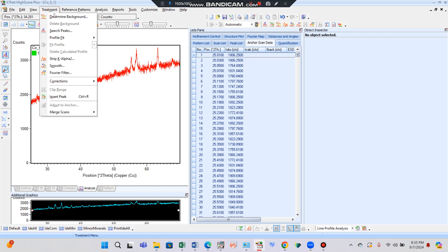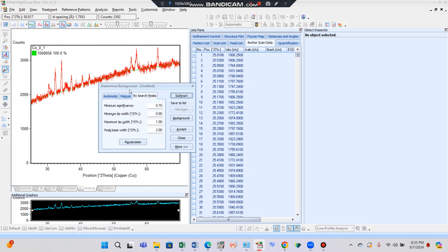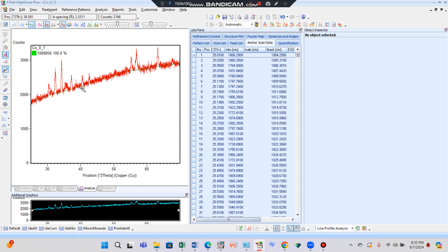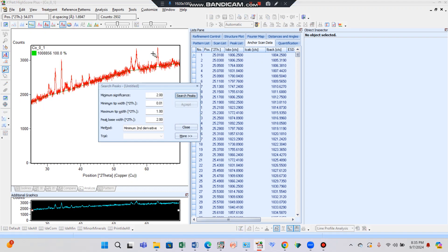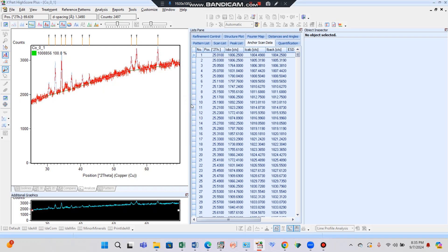Then click Treatment and then click Determine Background. Here we want to accept the background — just click the Accept button. By accepting, you can see a green line is set at the baseline of the graph. Then again click Treatment and then Search Peaks. Search Peaks means you are going to search the peaks. You can see this graph has many peaks, and after searching, all peaks are identified by arrowheads and then accepted.